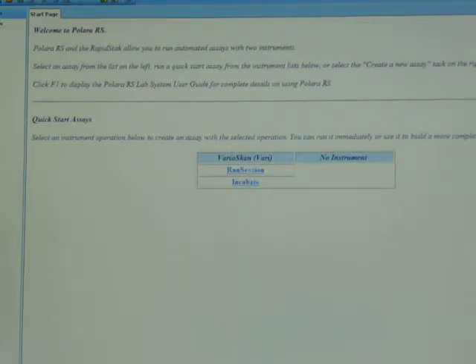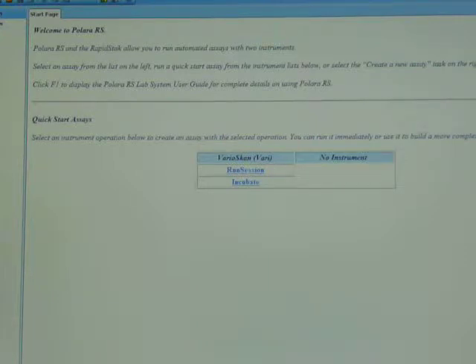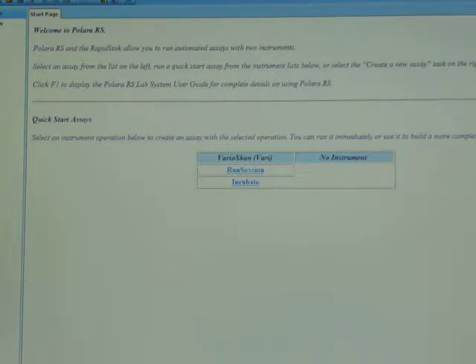To automate the VarioScan with the RapidStack, you need a piece of software called Polara RS. Today I'm going to demonstrate some of the functionality of the Polara RS software when used with the VarioScan.